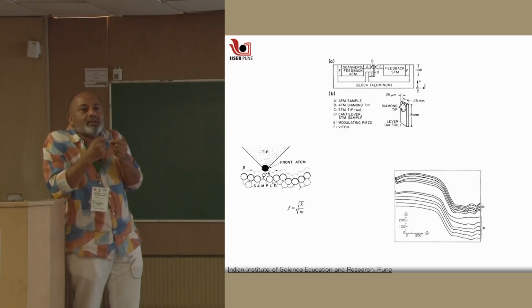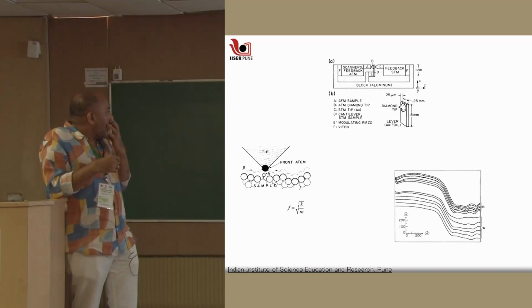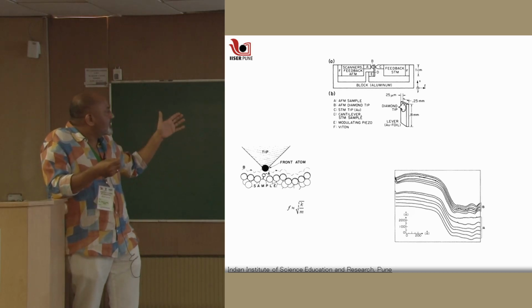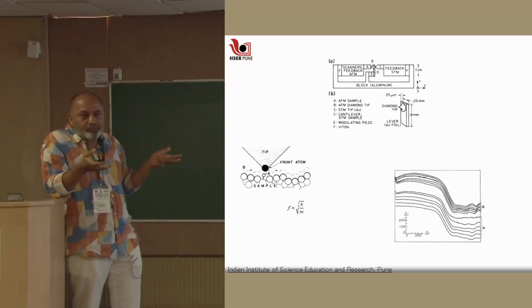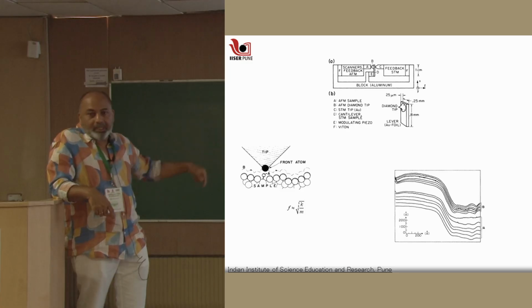Okay. This was a fundamental, I mean, it seems very obvious thing to ask, and this is what John Pethica kept on asking the team from IBM Zurich, what really happened in the first few conferences where STM was just getting popular around the world. And so then they went back to the lab and said, okay, fine, if this is the case, let's measure how much force your tip is feeling, right? And to measure that, they mounted a tip, which is a diamond tip, on a gold foil lever, and this diamond tip is now, because diamond cannot be made atomically sharp, of course, it's problematic. But then what they could do by doing it this way, they could actually measure atomic steps.